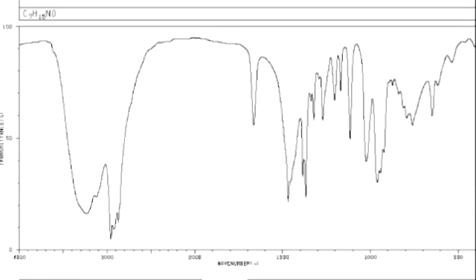Okay, so this is going to be our last molecule of the day. Go ahead and pause here if you want to try to work on your own, but I will warn you it is tricky. Okay, so now talking about the molecule. First of all, we see a bond that's not strong enough to be carbonyl at like 1690, but too far to the left to be an alkene. It should be at 1600.